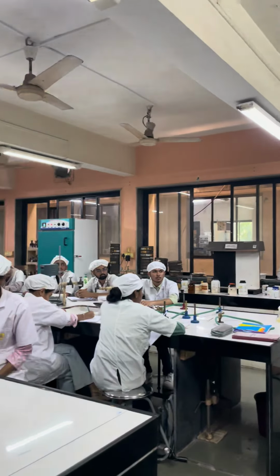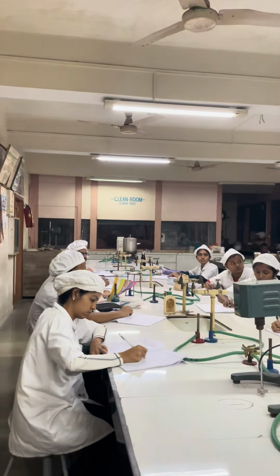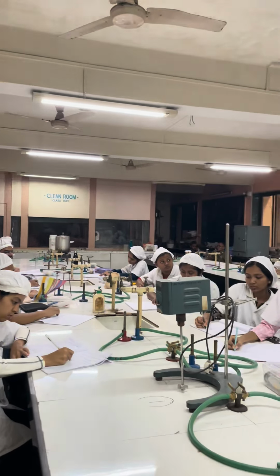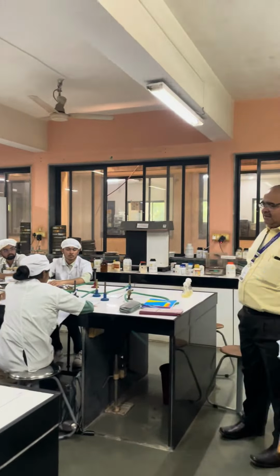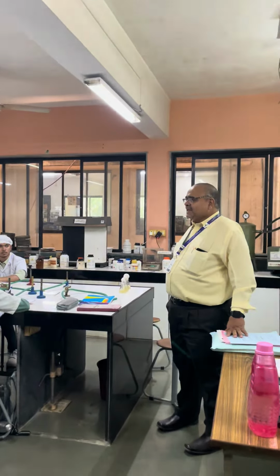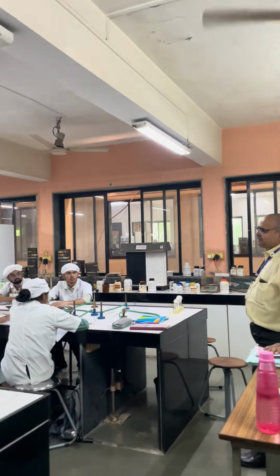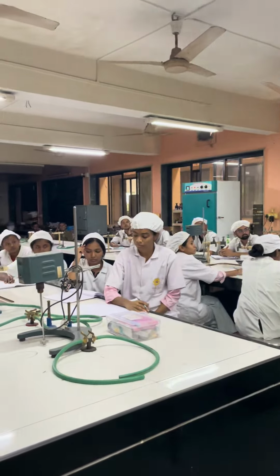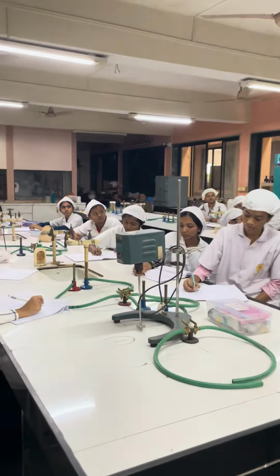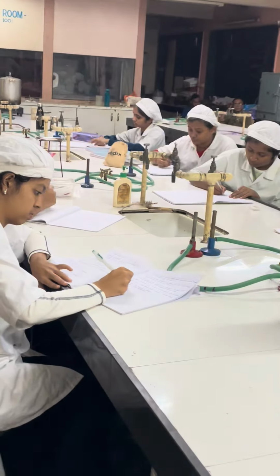Here, you have done this experiment in 3 rows. Per row, 3 test tubes, right? Now, the number of test tubes from the first row showing acid and gas production are reported. In a similar way, the number of test tubes from the second row and third row showing acid and gas production are reported in a tabular form.